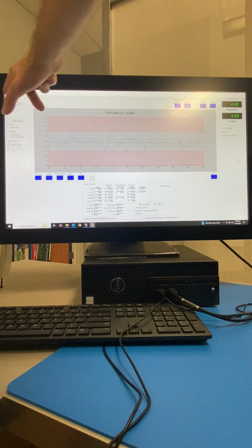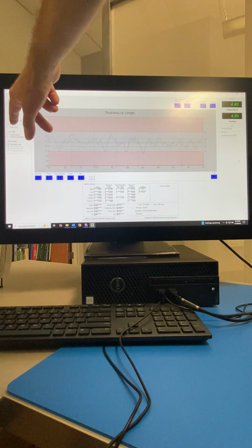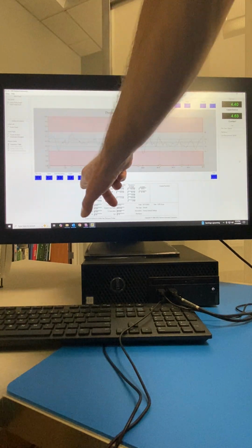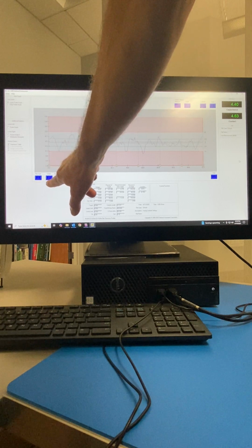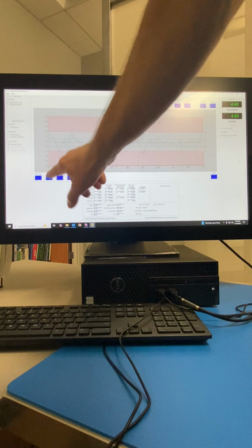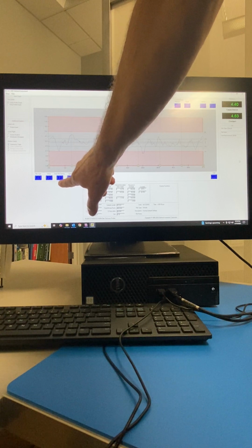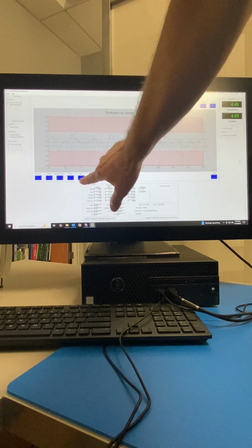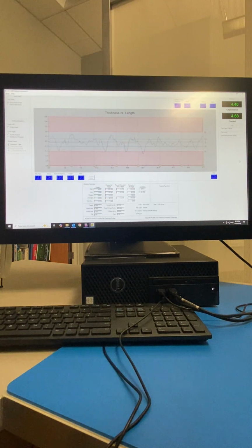On the left-hand side of the screen you can select different windows for different formats of your profiles and your statistics, which I'll demonstrate in a minute. Lower left is your film type, which is your recipe pull down for recipe storage. Setup screens are for setting up how you would like your graphics and your information to be presented. Data file options allow you to save and retrieve data files. The export button allows you to export your data to different formats, and a print button allows you to print to different report formats.